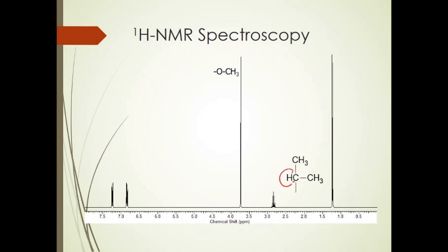And it is this CH that is giving rise to this peak, and this doublet is resulting from these 6 hydrogens. So this tells us how things are bonded. Again, this was 2 CH3s. The splitting told us it is bonded to a CH. And in fact, we have only 1 CH in our spectrum, and so those two are bonded to each other. And so we have this part of our puzzle, or this part of our structure, so far from the spectrum.